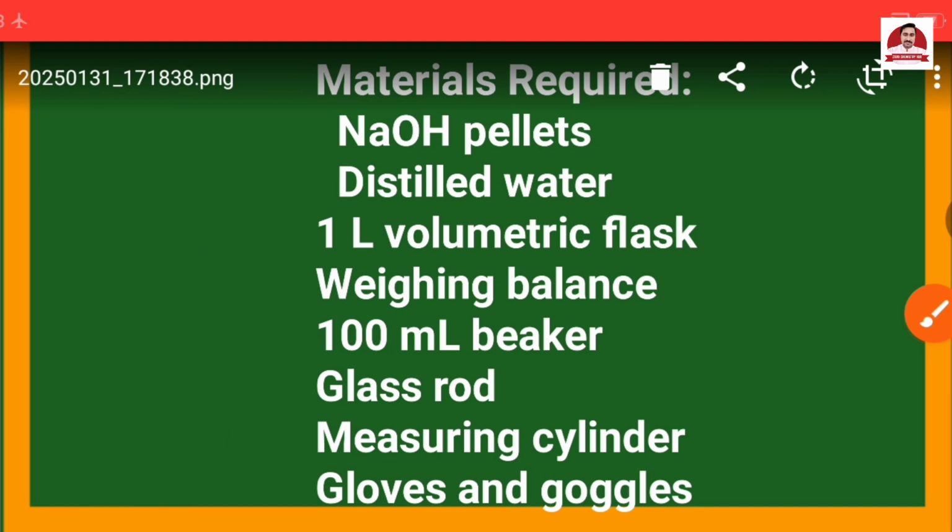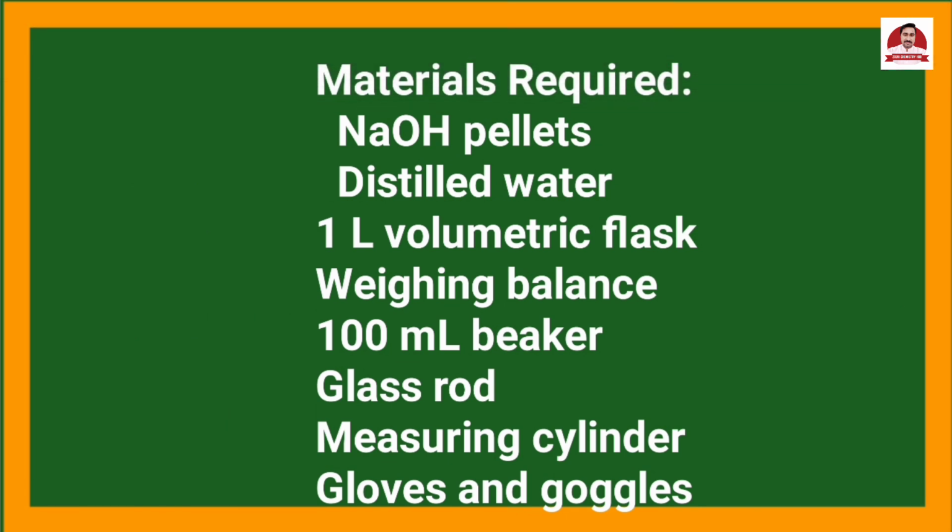Next, what is the material required for the preparation of 0.1 molar sodium hydroxide solution?